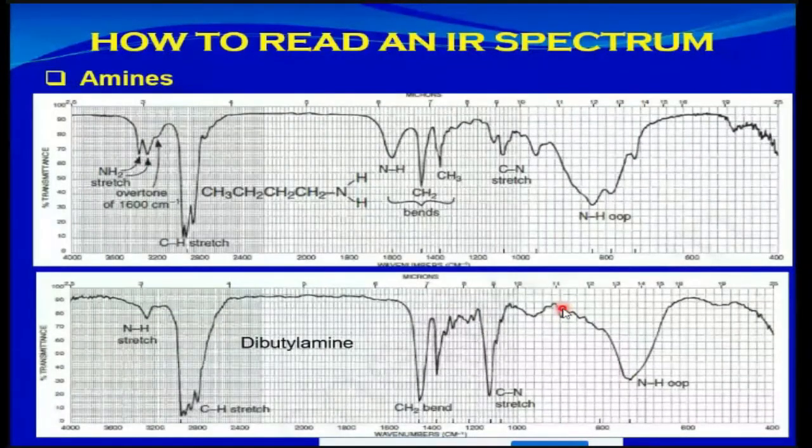Here we have some examples. The first one is a primary amine. You see the NH2 here, and here is this medium or low intensity peak that appears in the form of a doublet for this NH2 stretch here, right? And here we have the CN stretch around 1100 1000 per centimeter, and you can see the bending vibration here for the NH around 1500 to 1600 per centimeter.